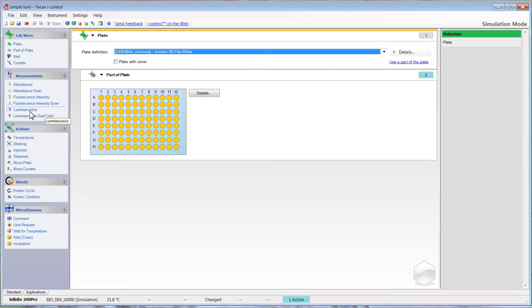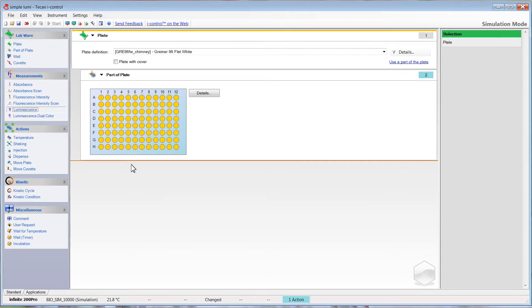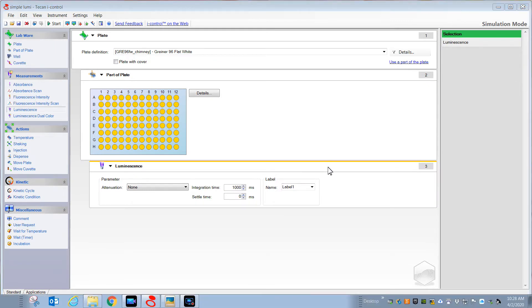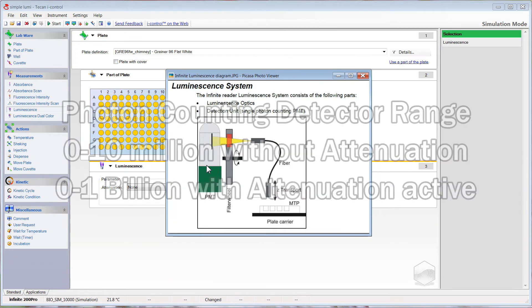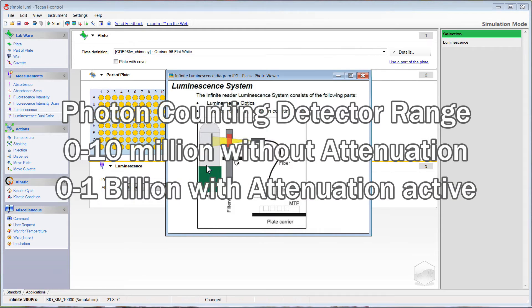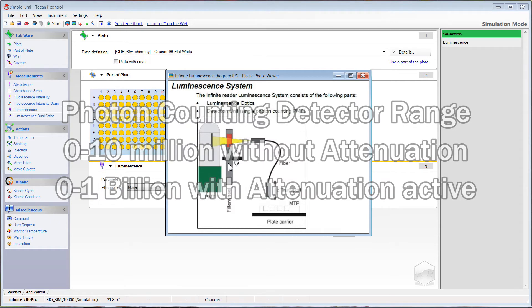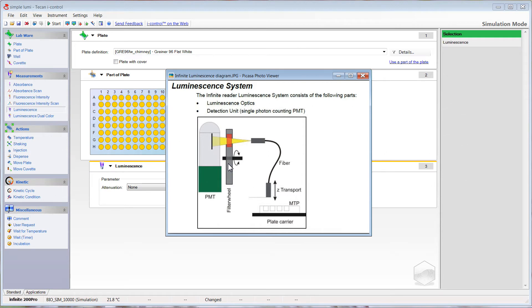If you're just going to measure all white light coming from the wells, you'll grab this luminescence strip and drag it into the screen and release it here. This strip invokes the use of the reader's photon counting photomultiplier detector. The plate carrier holds your plate, and there's a motor which translates a small lens up and down — that lens is coupled to a fiber optic, and the light is guided through a filter wheel onto the detector. This detector can see signals from essentially one count per second all the way up to one billion counts per second, and the built-in filter wheel has a couple of different colored filters as well as a neutral density filter.